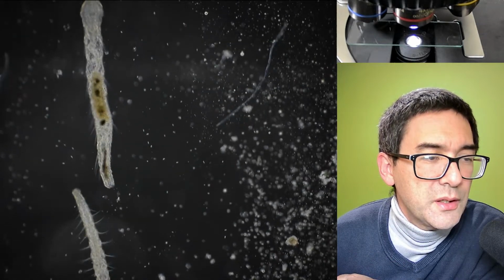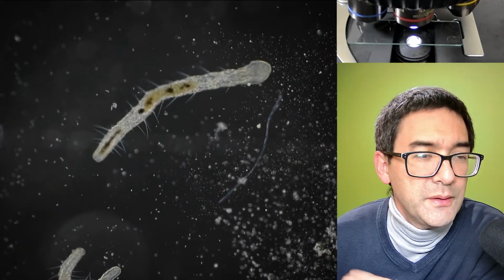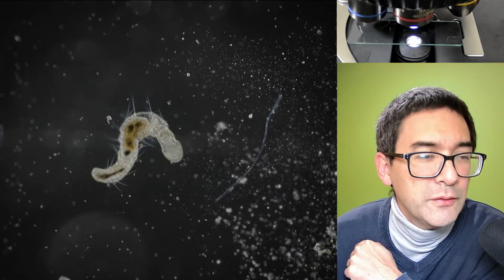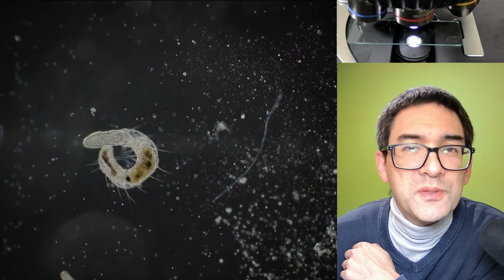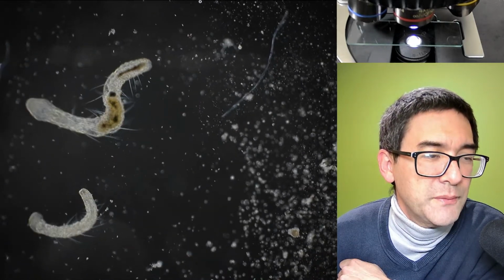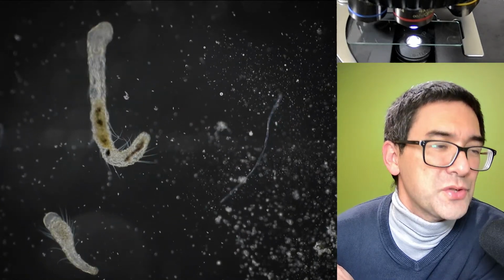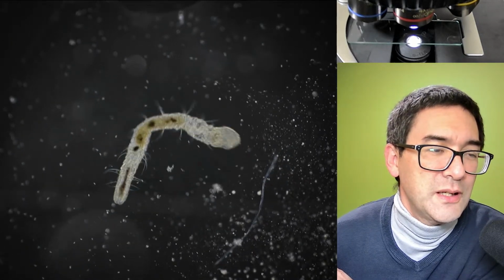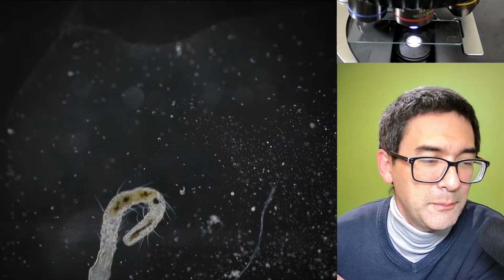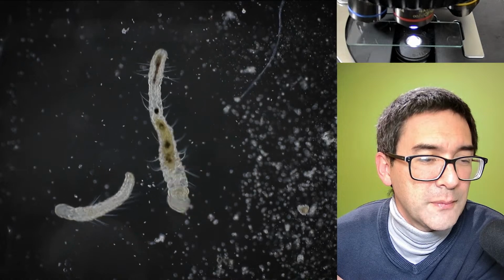Those worms like to reproduce by dividing in half as well. This basically means that a new head starts to grow right in the middle of the body of the worm, and then the two worms separate. It looks quite interesting. Some time ago, I spent many hours just observing those worms as they reproduce that way. You can see that over the hours, the head starts to grow more and more, and then it will separate, and then you've got two worms.